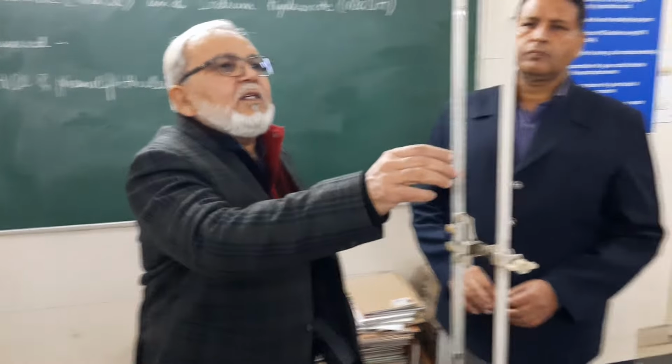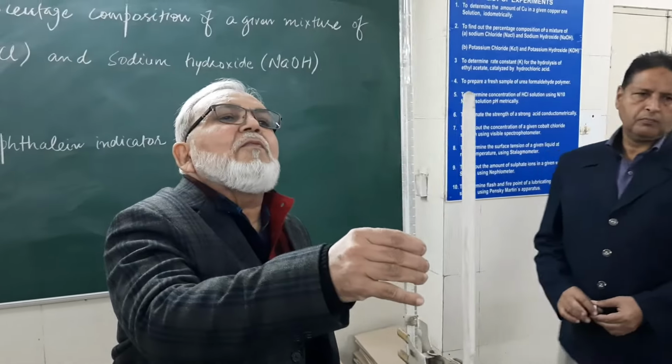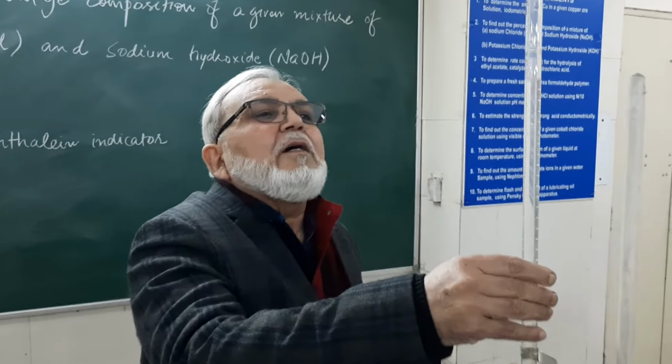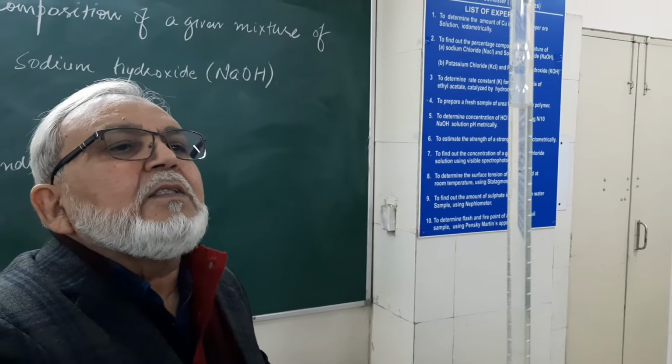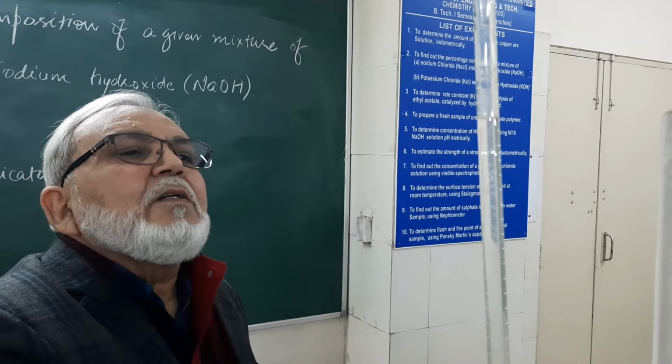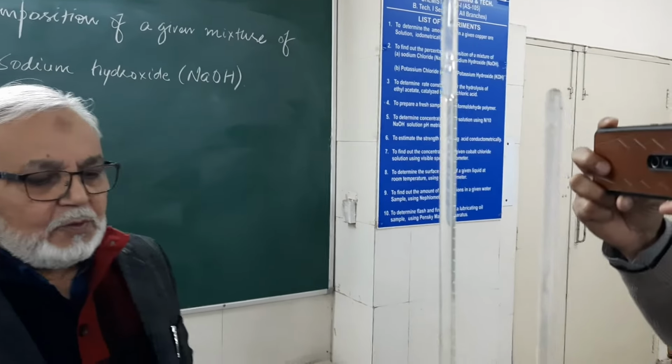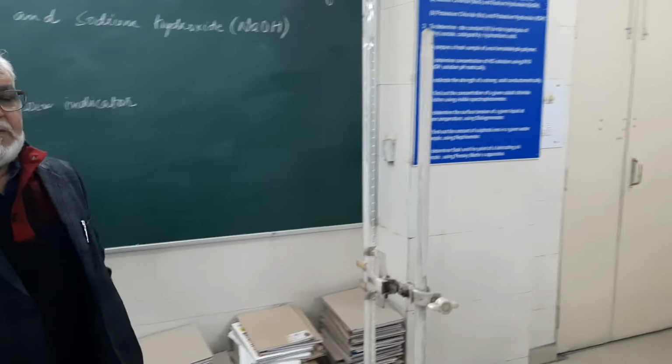The concordant volume of HCl consumed is 2.1 ml.